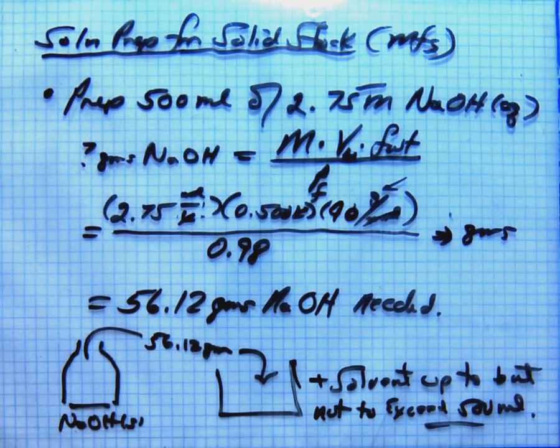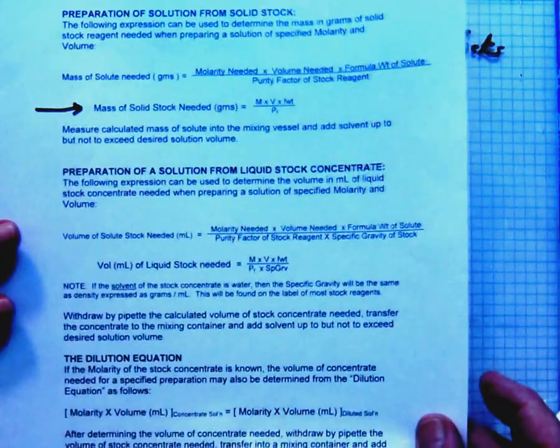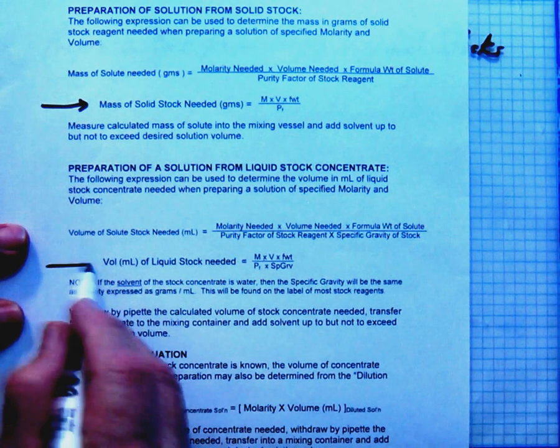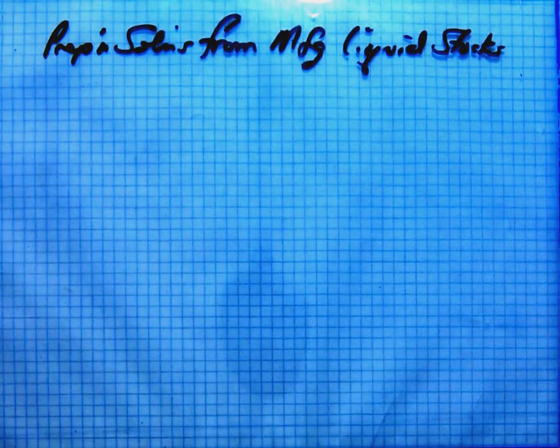Next, we're going to the second part of our handout. You'll see here it has a formula just like what we did right here, and your interest is to have a problem and use this formula this time. Typically, these will be acids. Now, ammonium hydroxide and stuff like that comes in liquid form, so that's one of the few bases that is worked with. But the majority of these are acids. So what we're going to do is dilute a stock acid solution.